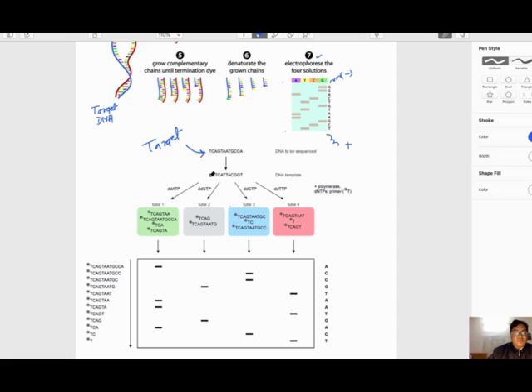Starting from the first one, in front of A there will be T, C, but the third one is A. The 3 nucleotides here, TCA, will be cleaved from here. Then again, wherever TT comes, in front of them A will come, and the chain will get terminated there only. So 4 nucleotide sequences will be formed if we cleave this DNA with dideoxynucleotide, because at the dideoxy the chain is terminated.